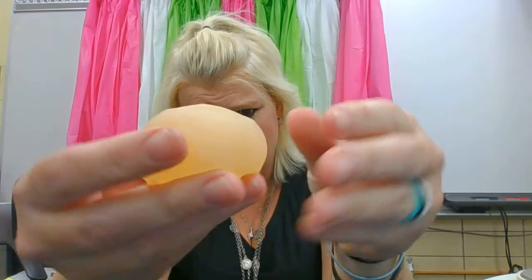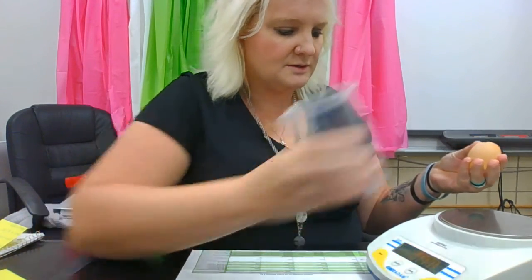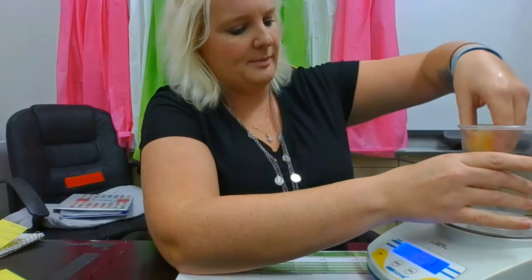Let's find the mass. I'm going to use my digital balance, turn it on so you can see. I don't want my egg to roll around so I'm going to put the cup on and hit tare, which makes it zero, and then I'm going to gently put my egg in the bottom to find the mass.